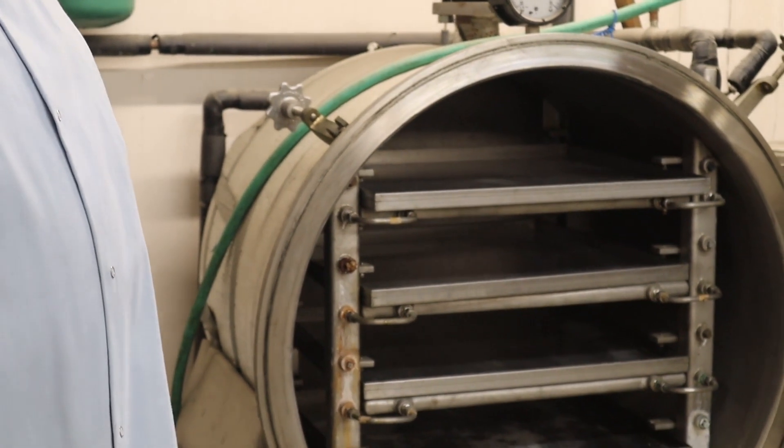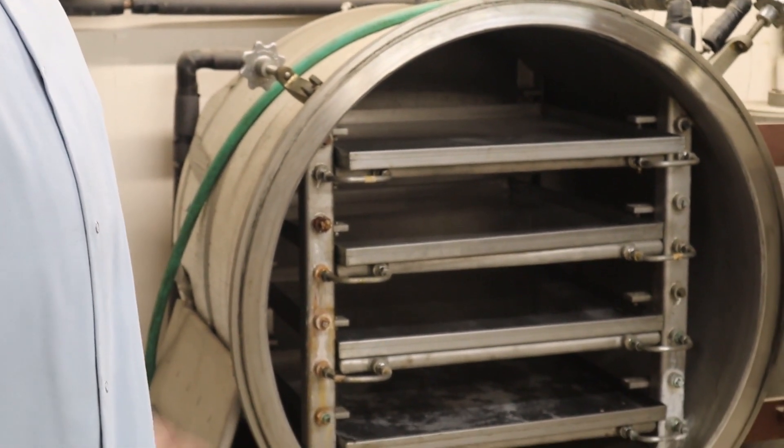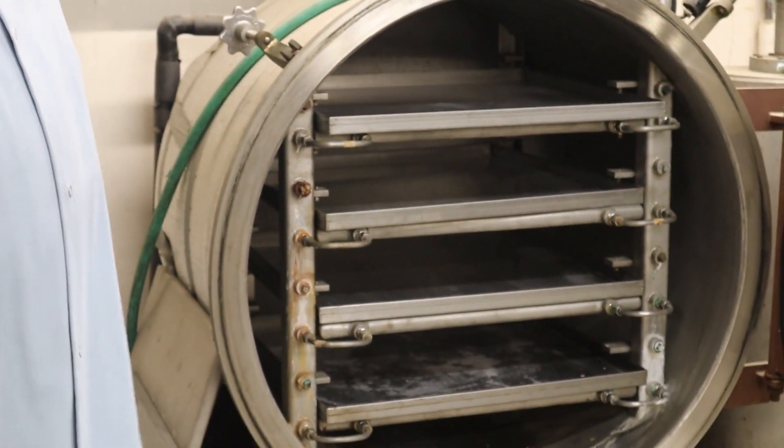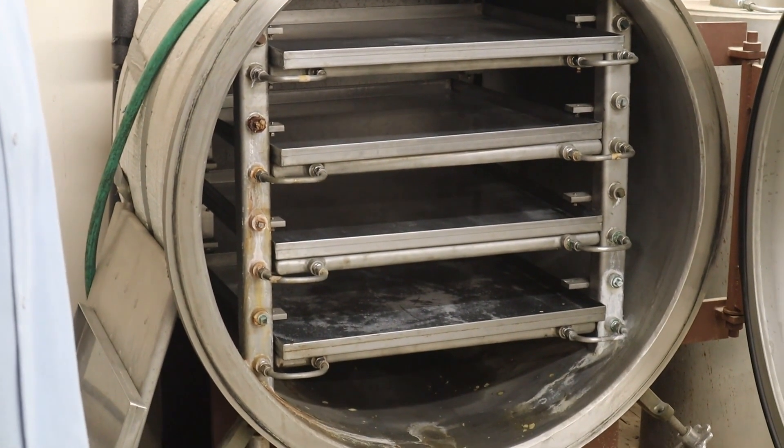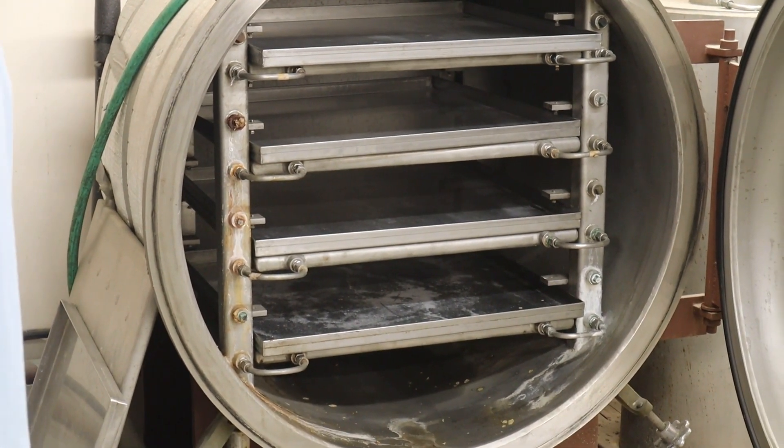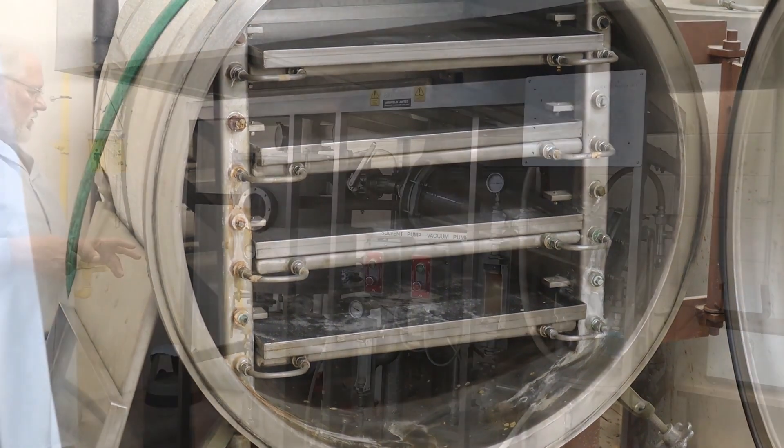Normally, if I'm doing two batches, the first batch will get about a five-hour dry time and the second will get the overnight time. But they usually come out pretty low on hexanes.